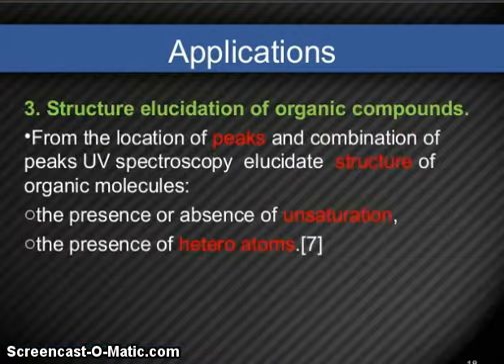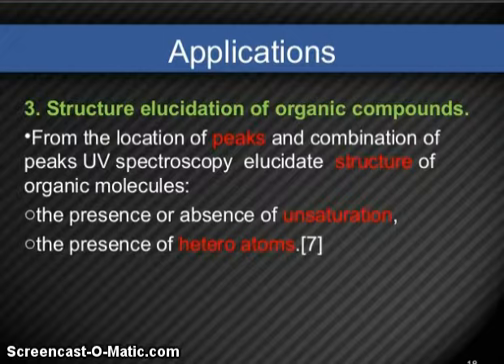So structure elucidation of organic compounds from the location of peaks and combination of peaks. UV spectroscopy elucidates the structure of organic molecules: the presence or absence of unsaturation, the presence of heteroatoms.